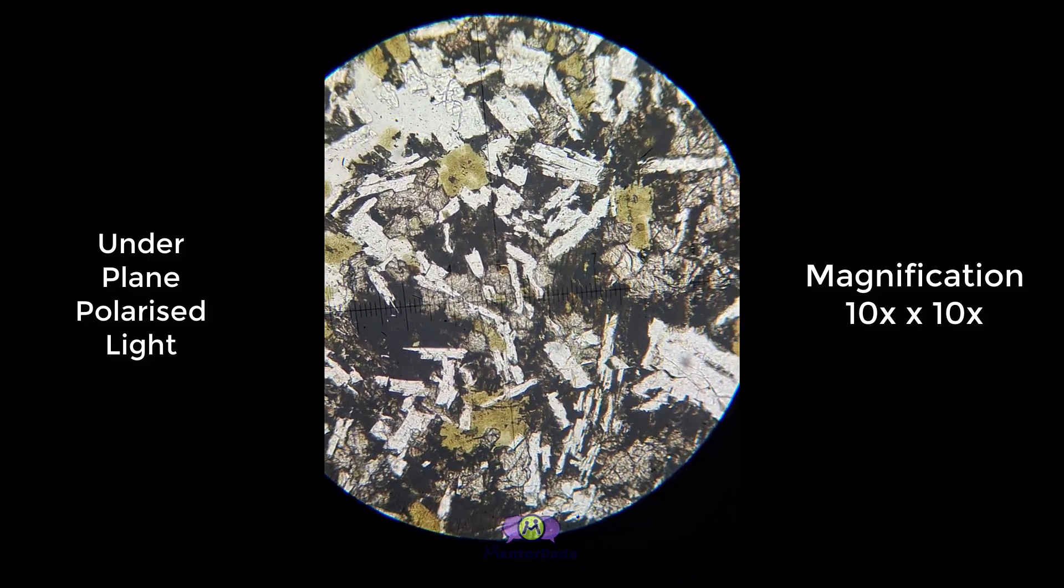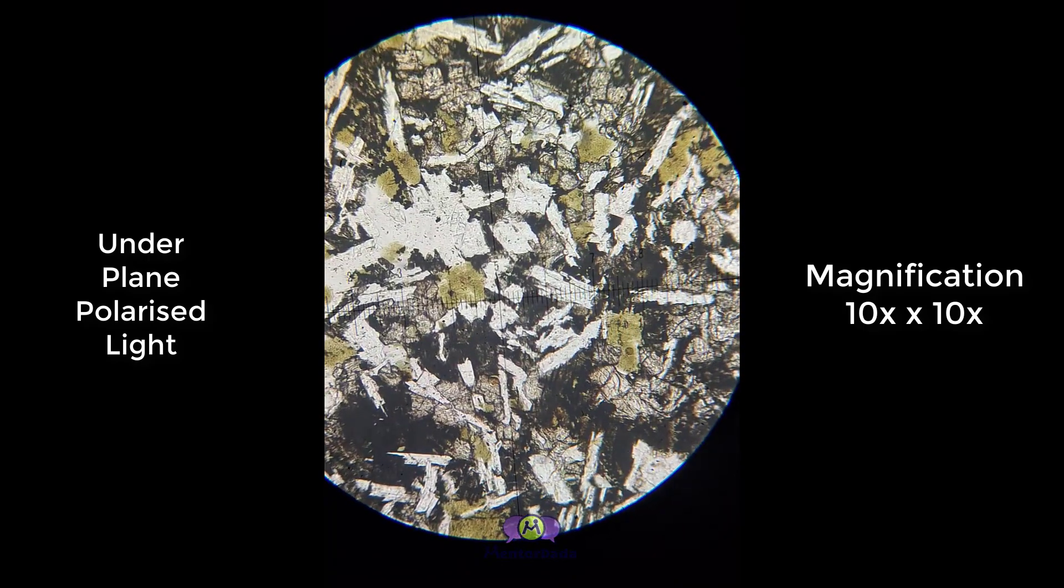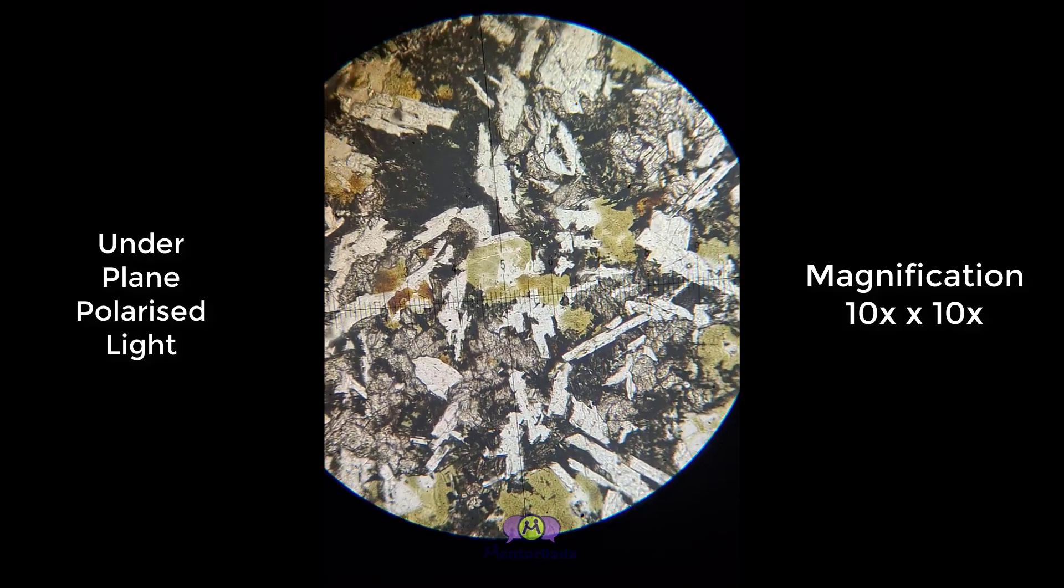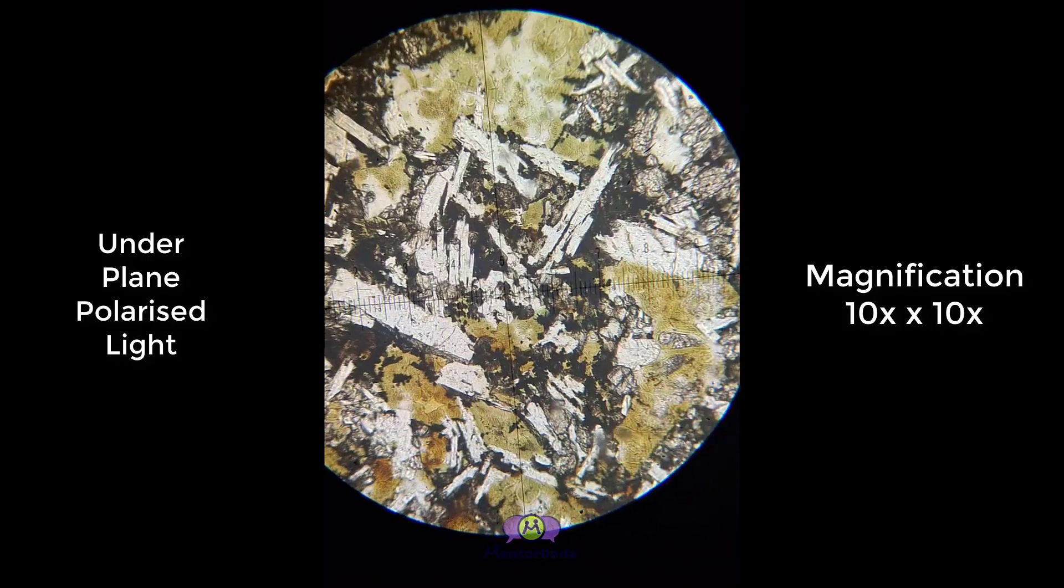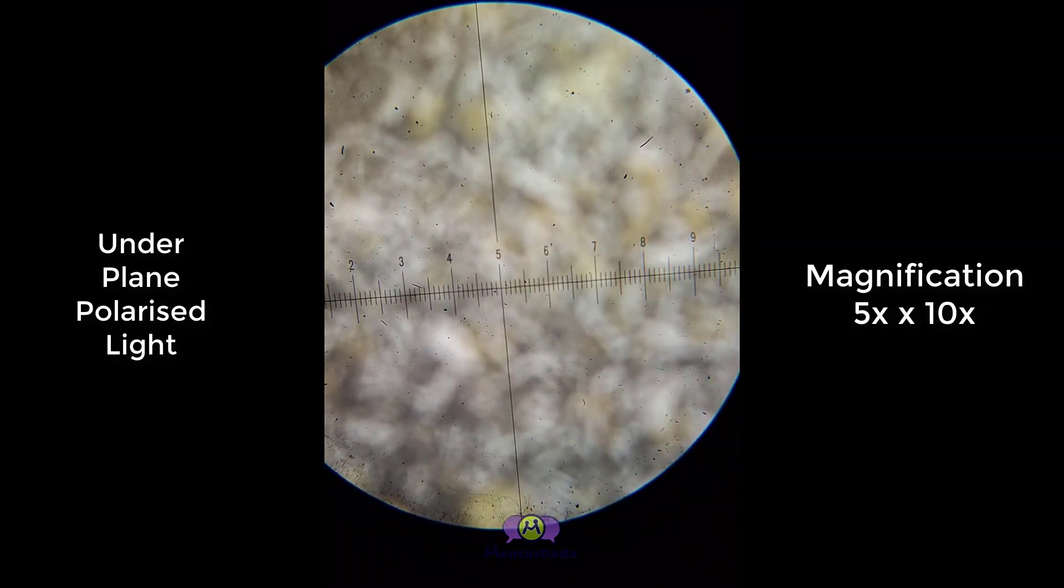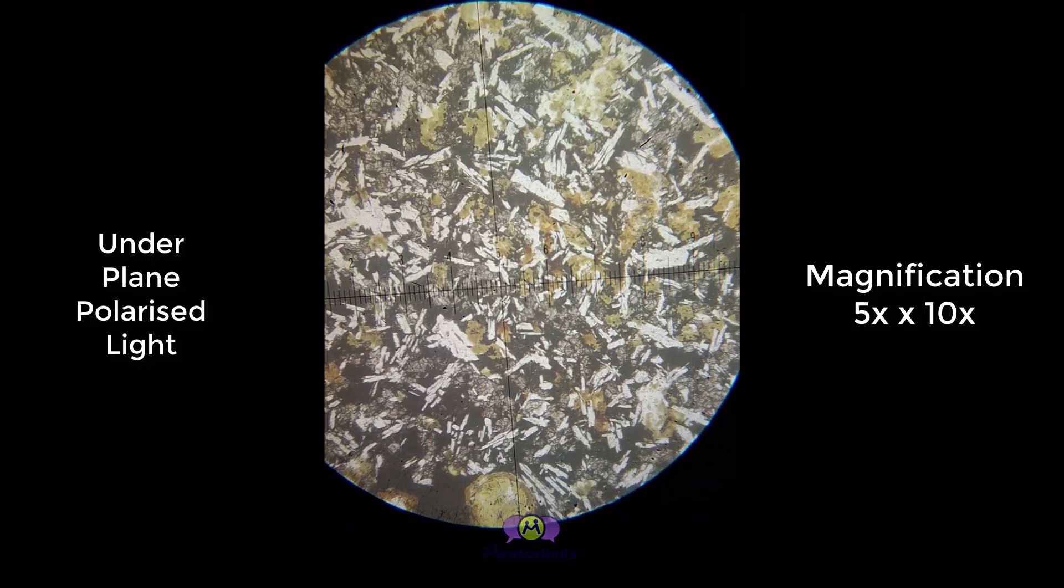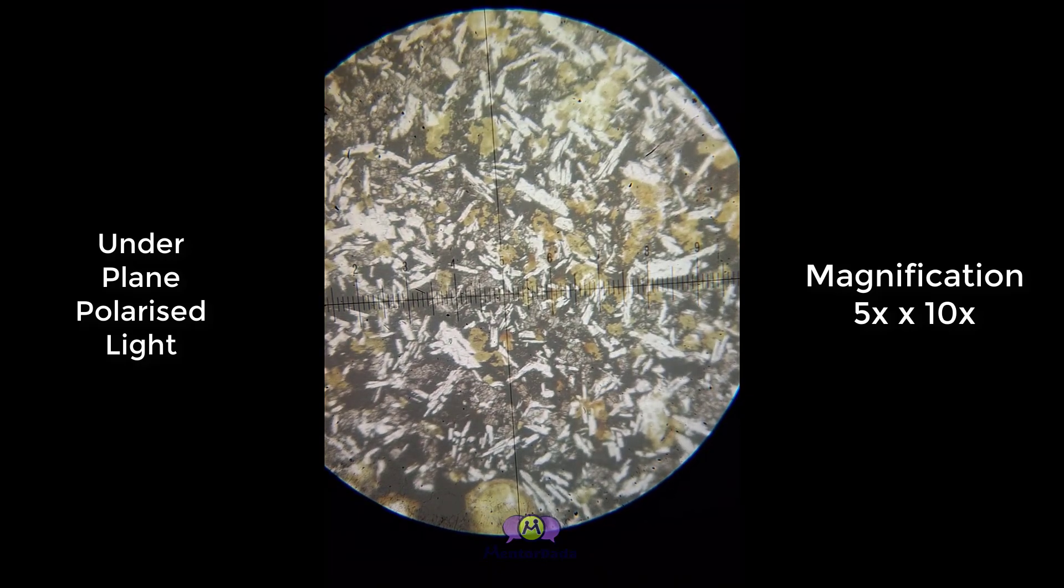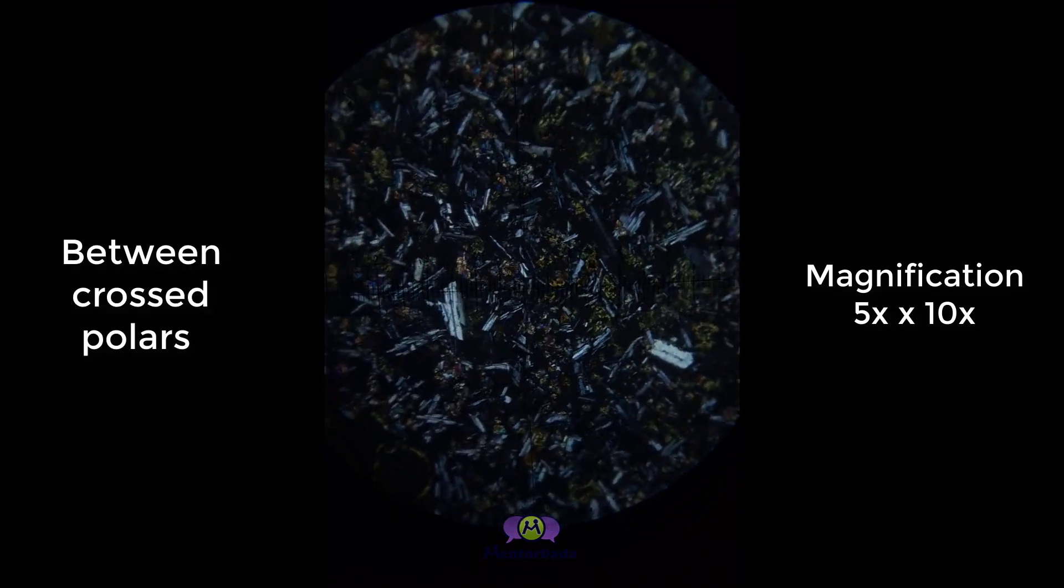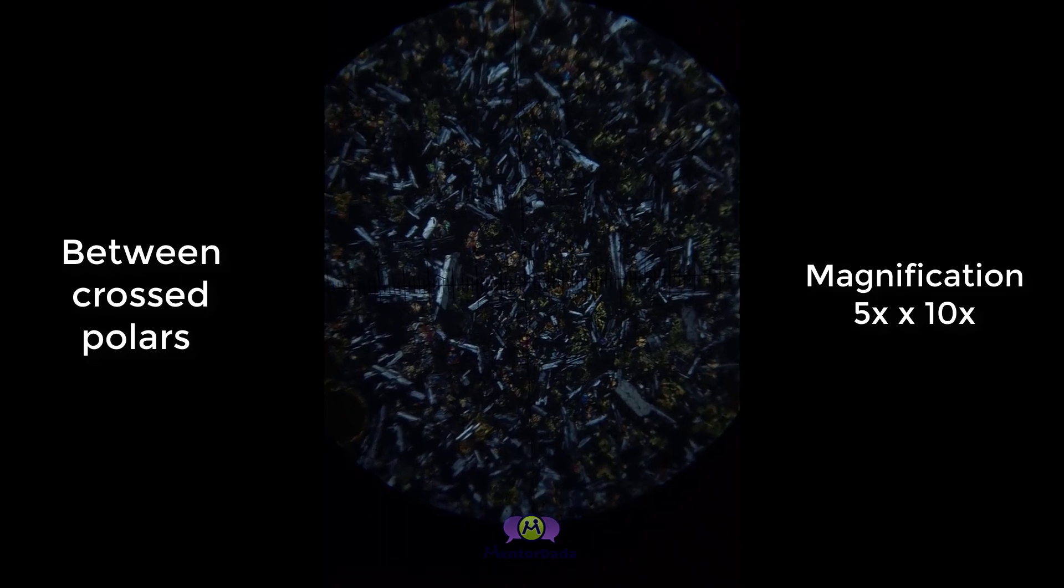The white colored laths are plagioclase and the green patches are glassy material. The name of this rock is basalt.